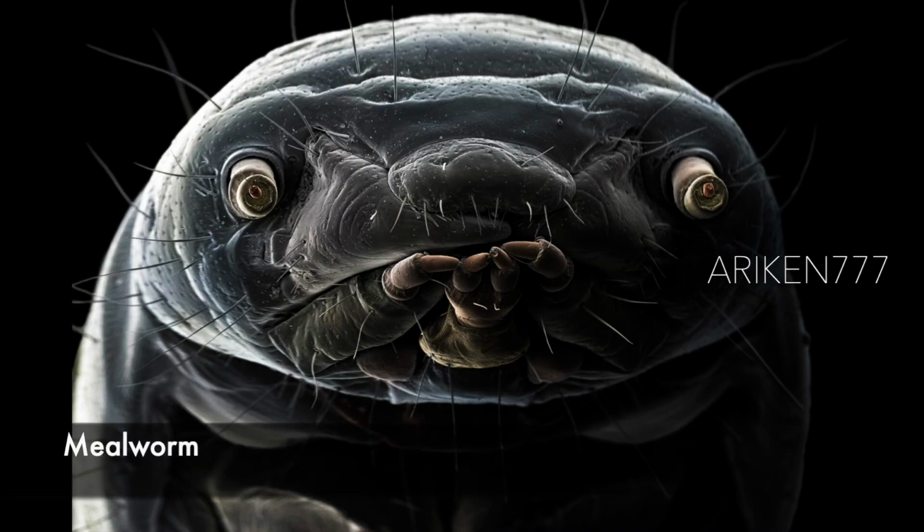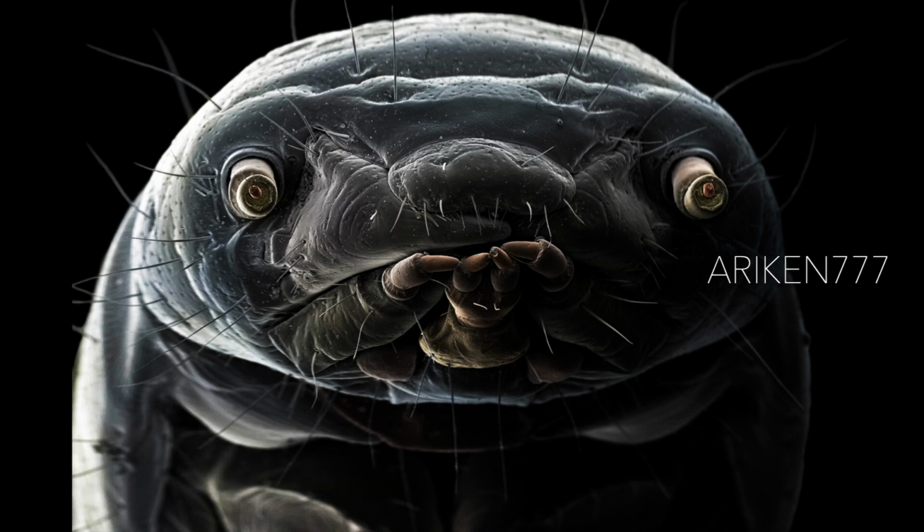This is a mealworm, the larva of the tenebrio beetle. They are often used as bird feed and fishing bait and are sometimes used for human consumption. Insects contain a far higher protein content than meat from traditional farm animals. It is thought that insect-sourced protein could be the answer to food shortage problems of the future.